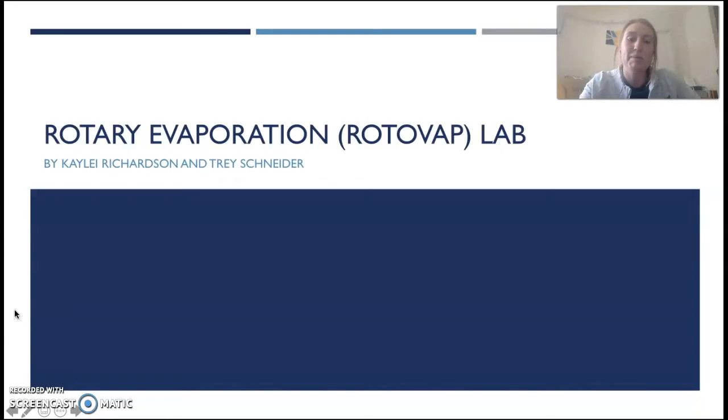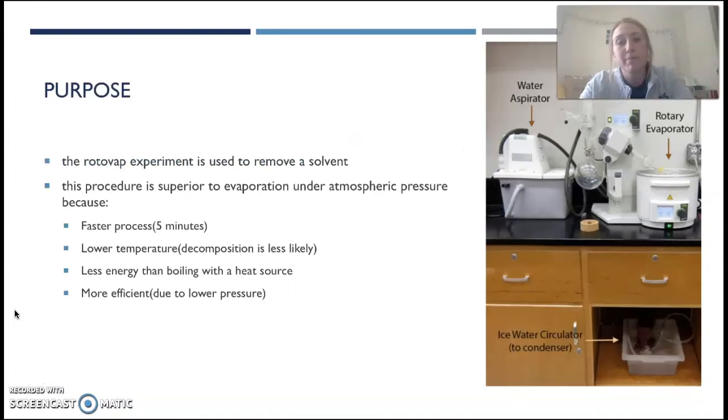Hi, my name is Kaylee and my partner's name is Trey, and today we're going to be talking about the Rotary Evaporation Lab, also commonly known as the RotoVap Lab.